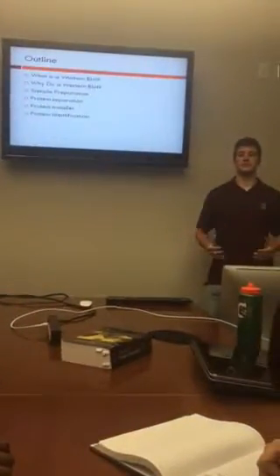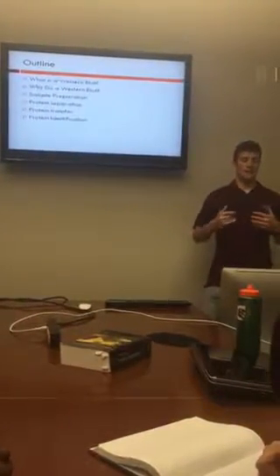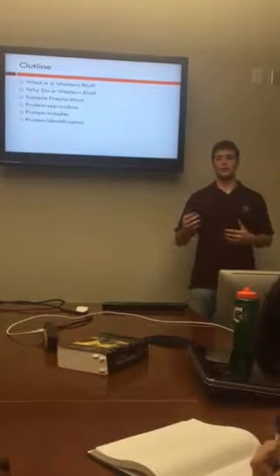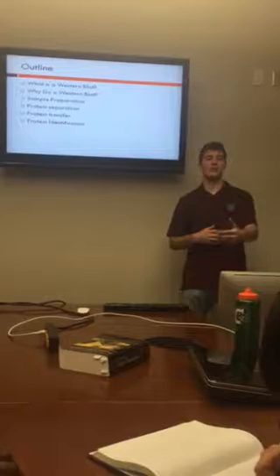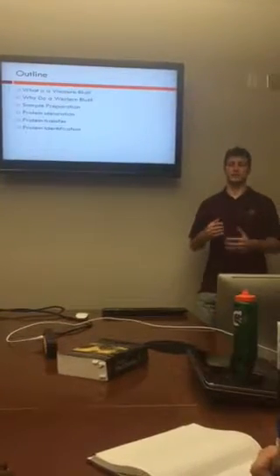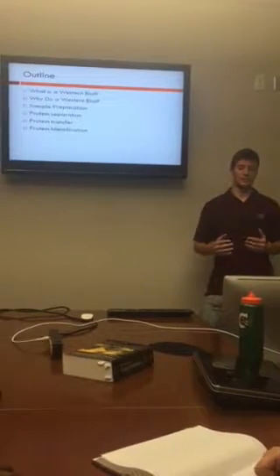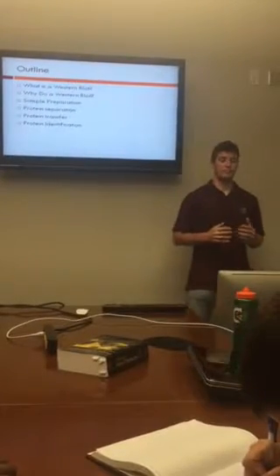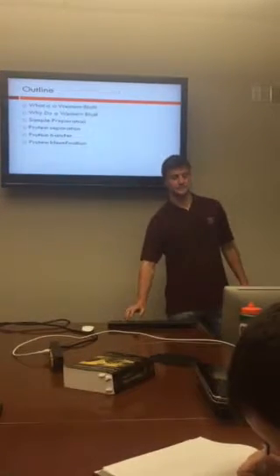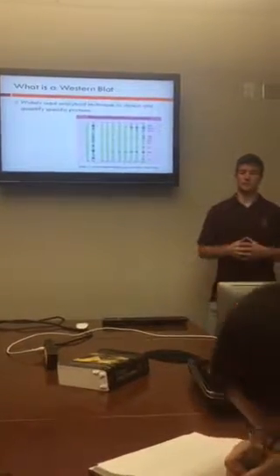The first thing I want to do is present y'all with an outline. We're starting with what is a Western blot, and I'm going to move on to why you want to do a Western blot, how knowing how to do a Western blot might benefit you in the future, and then I'm going to go into the procedural steps associated with a Western blot, which include sample preparation, protein separation, protein transfer, and protein identification.